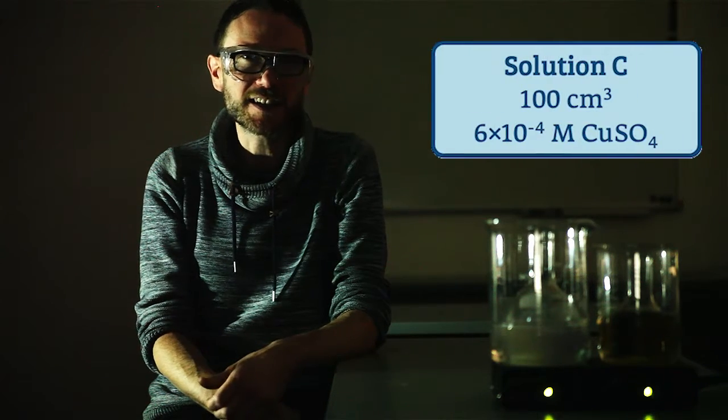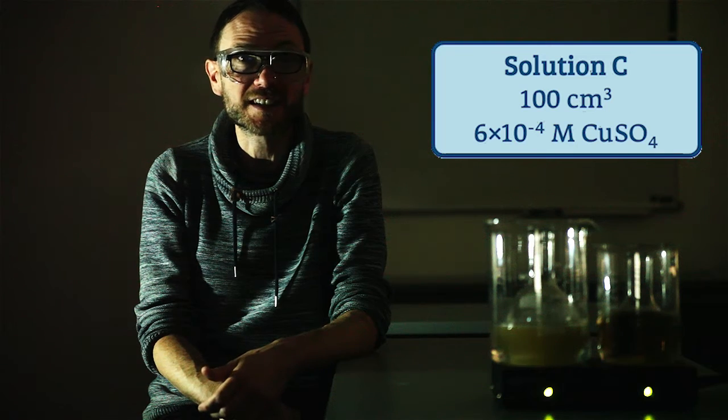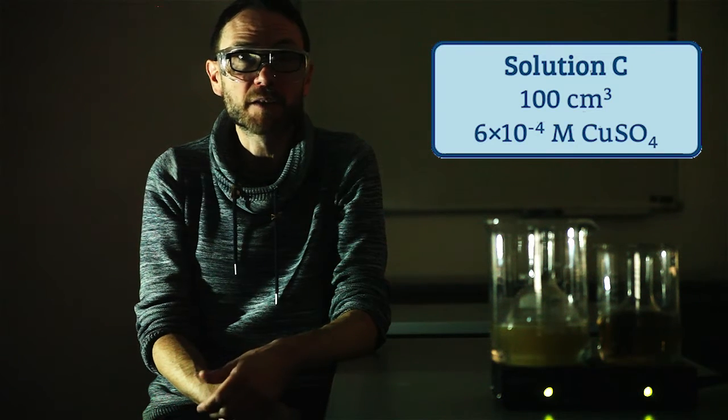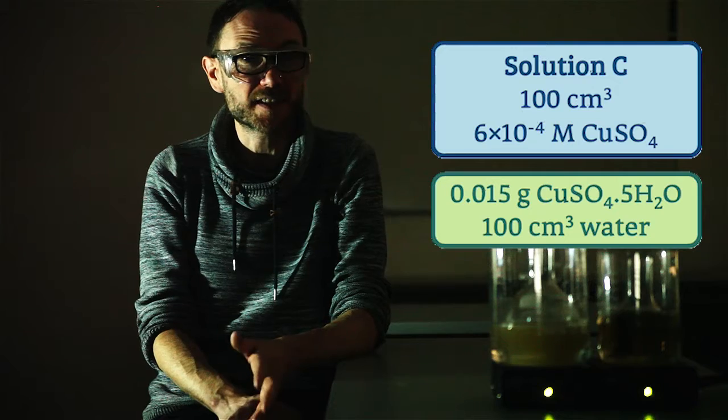Solution C is an implausibly dilute solution of copper 2 sulfate, approximately 6×10⁻⁴ molar, made up by dissolving 0.015 grams in 100 cm³ of water.